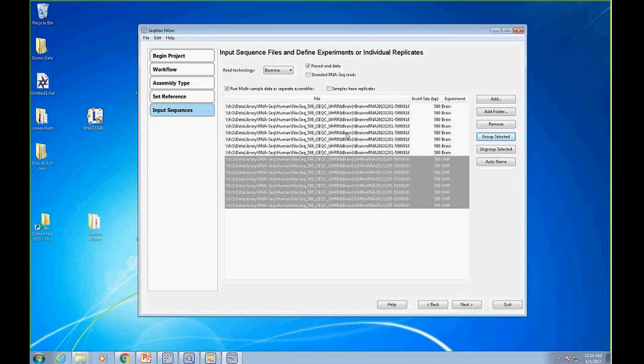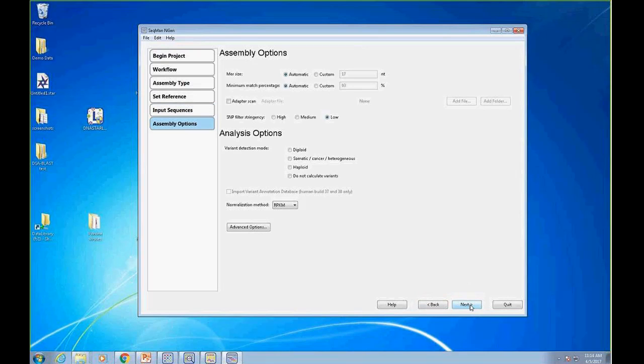If you're interested in genes that are expressed at low levels, then really the more data you can add, the better. Because all the RNA-seq is going to be expression values, and the isoform analysis is going to be based on depth of coverage. So you need to have coverage across those genes that are expressed in the low range if you want to analyze those. So that's just something to keep in mind. More data is usually better for RNA-seq.